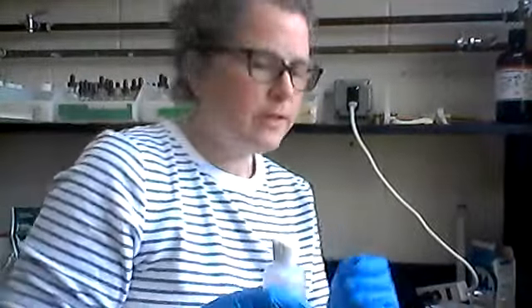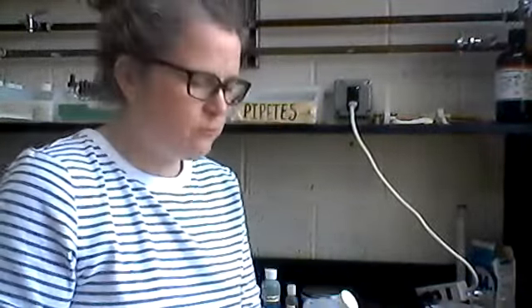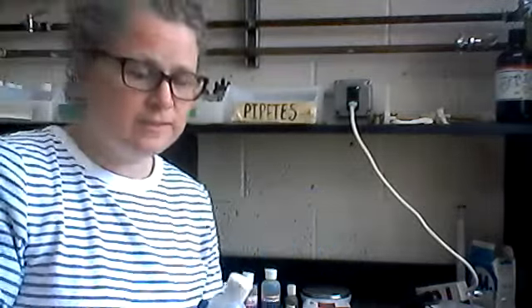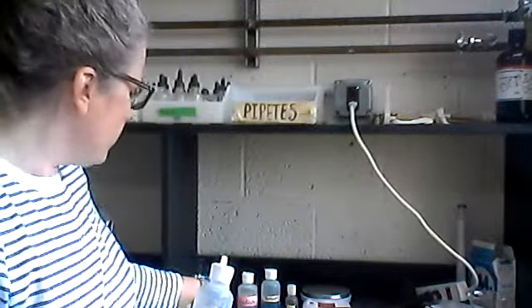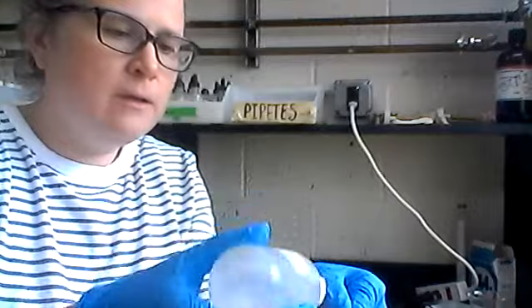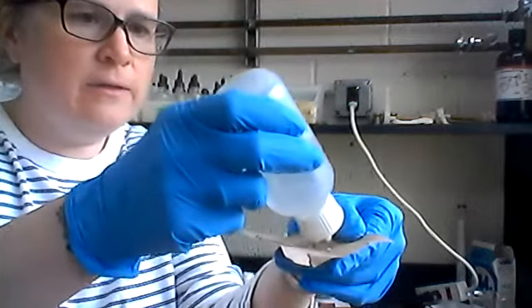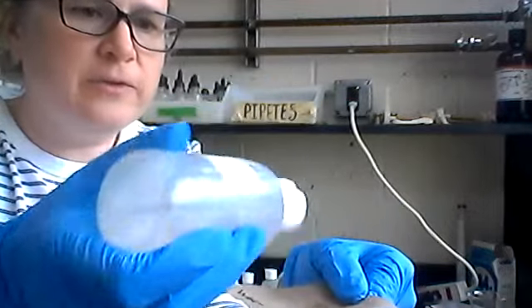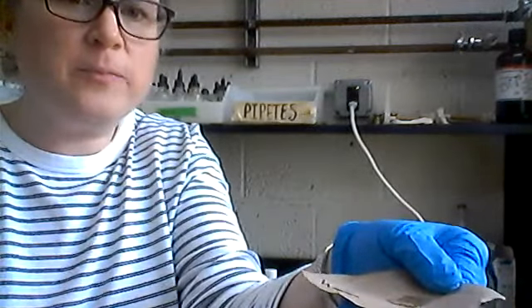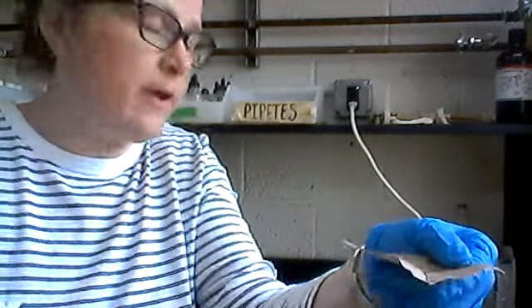Okay, so I'm all ready to go. Our first test we're going to run is going to be the lipid paper test. So I'm just going to take each of these different substances, do a small drop right on the paper. So you can kind of see what I'm doing here. And we've all done this. We've all seen drops of water on a piece of paper. I'm just going to let it sit and dry.